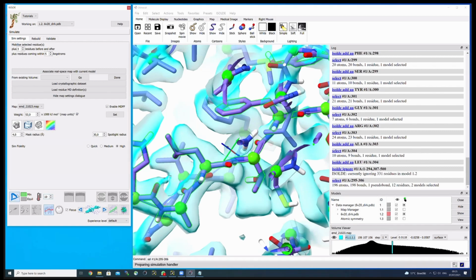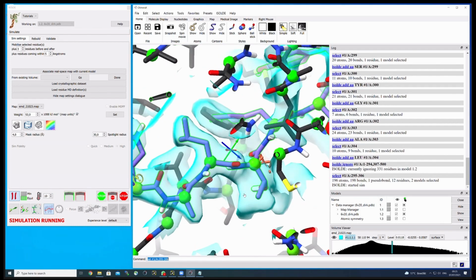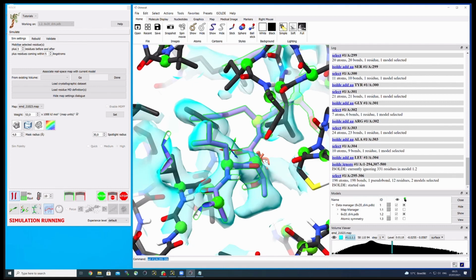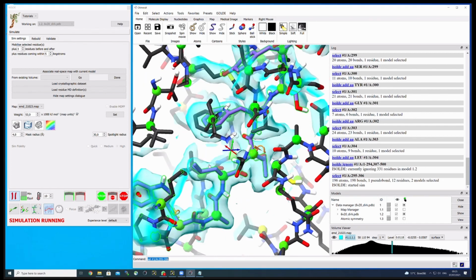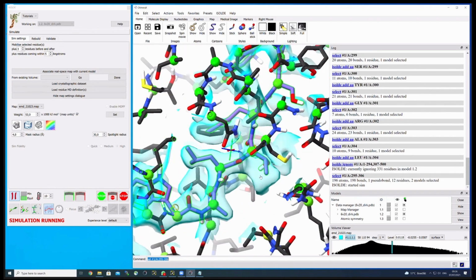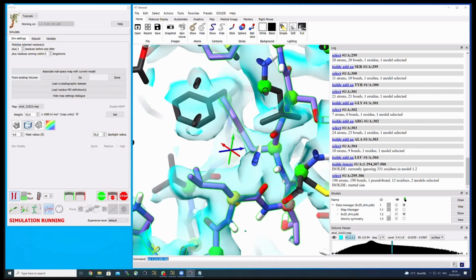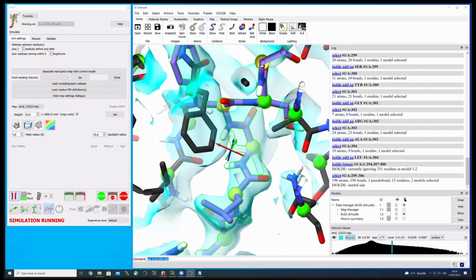And I go into play mode, so the simulation starts, and what you then should see is that all the residues that you basically ignored will turn black. So they're not moving because the simulation is now ignoring them. And like this, you now have also the freedom to basically move around the newly built stuff freely, even if there is stuff in the environment, without many problems.